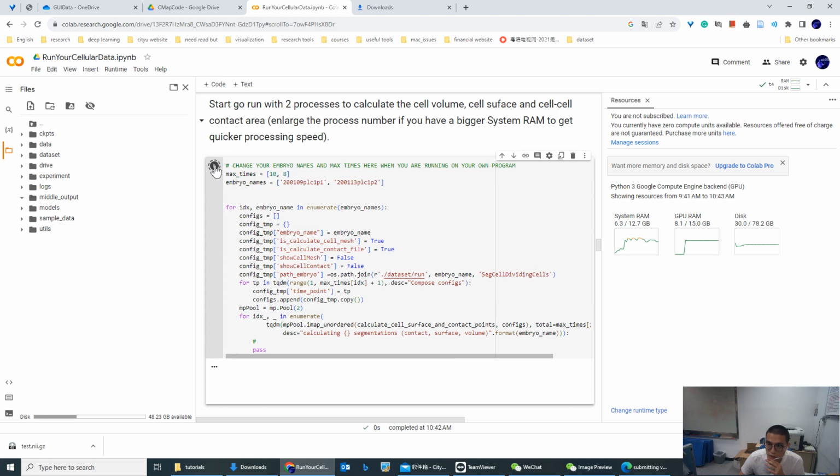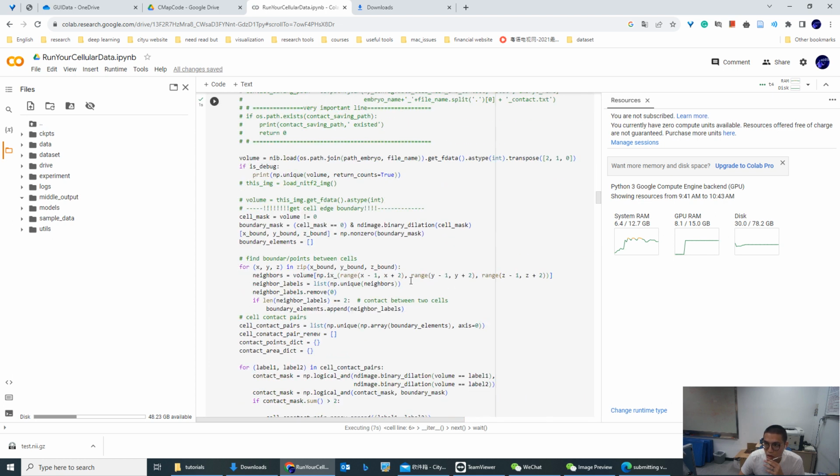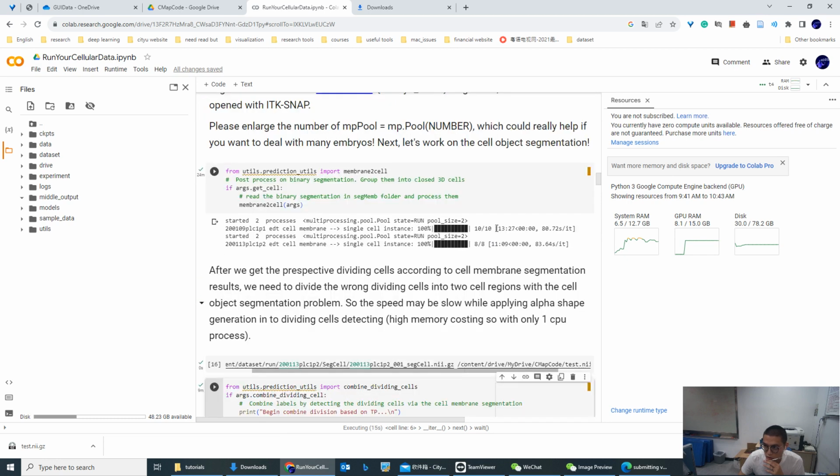Just click to run the cell. Some cells take some time. You see here it takes 6 minutes or 30 minutes.